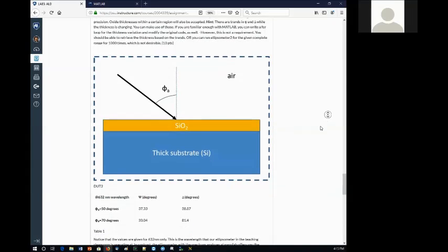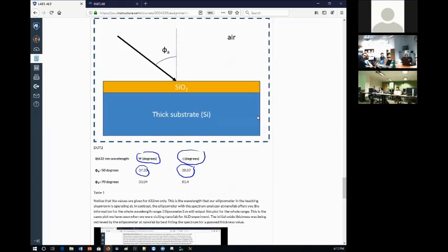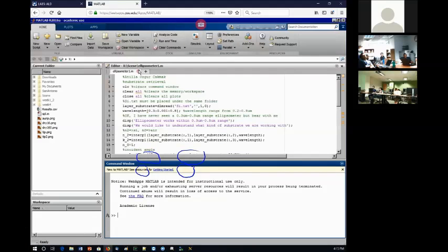These are the measurements. The measurements say that at 50 degrees, I have these two measurements. The physical sense of the measurements is not very critical for us. It would take me a while to explain them, but it's not important. Just assume as if you're just noting down, as an engineer in the lab, the measurements that you see on the ellipsometer's monitor, okay? These two measurements, psi and delta. Okay, now going to ellipsometer 2.